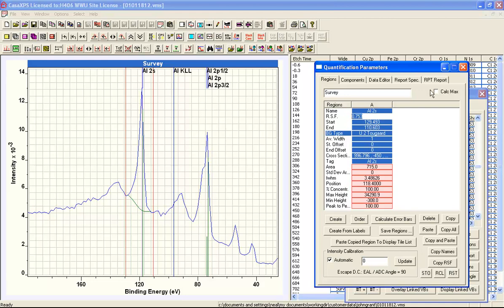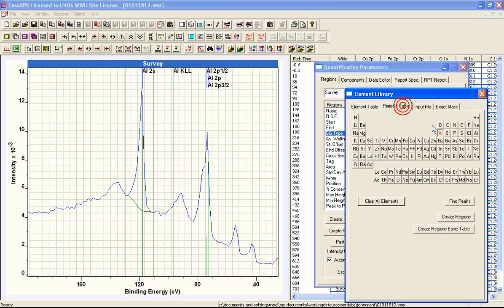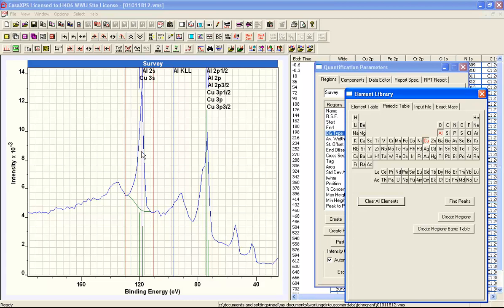However, in this instance, we have a sample with not only aluminium but also copper. Unfortunately, copper and aluminium overlap in such a way that we can use neither the aluminium 2s nor the aluminium 2p to quantify from a survey spectrum, because copper overlaps both. Furthermore, in this particular case we also have chromium, which introduces yet another peak that overlaps with the aluminium 2p.